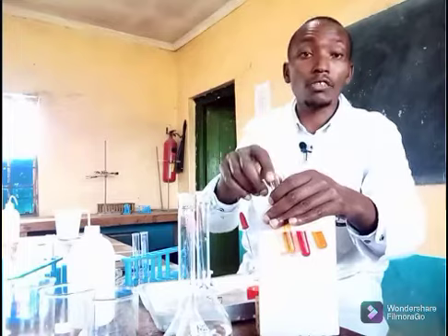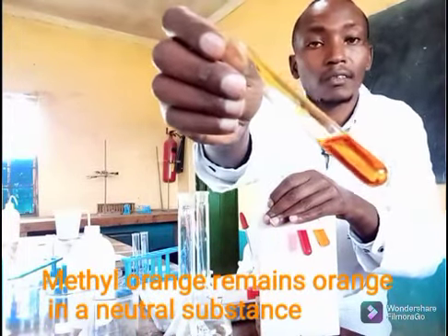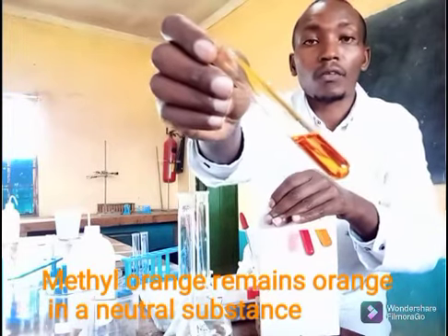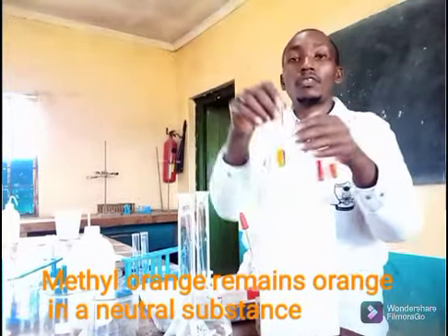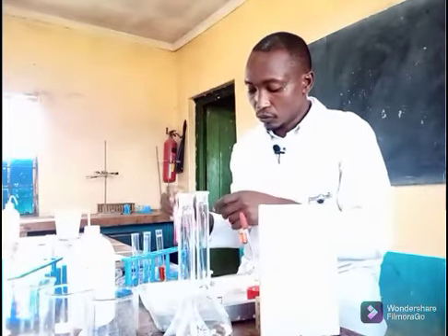Then finally I'll put methyl orange in a neutral substance. It remains orange, so it's just the same thing. That is methyl orange in a neutral substance.